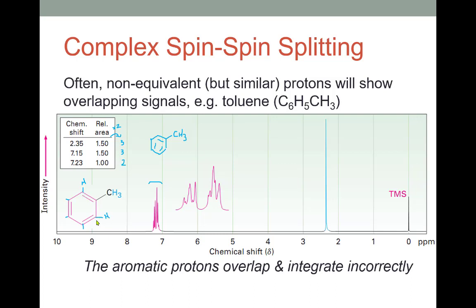They're equivalent to each other, but they're just slightly different to the hydrogens at the second shoulders. And those are slightly different to the one hydrogen straight across. So what are we seeing here? Technically we have a group of hydrogens here, a different group of hydrogens here, and a third group of hydrogens there.